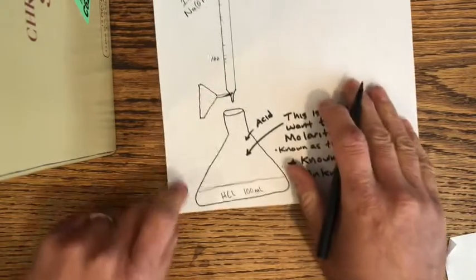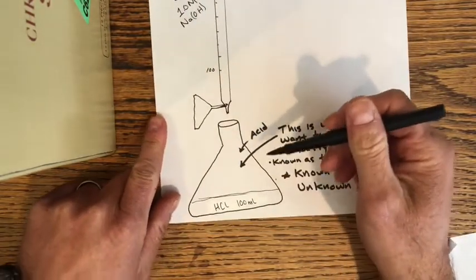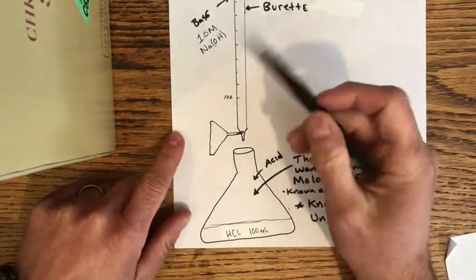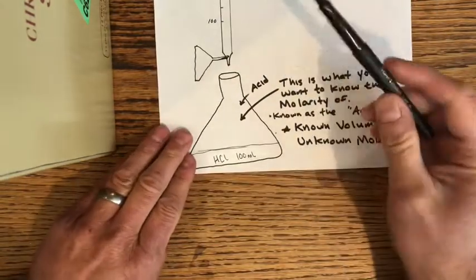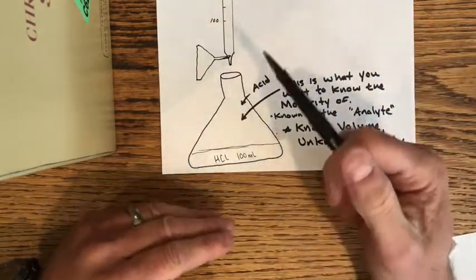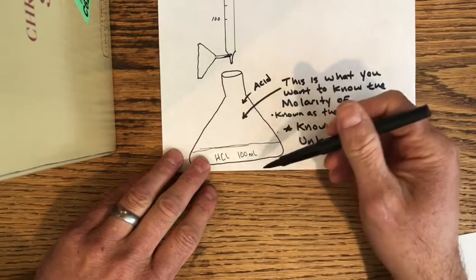Okay, so if you were to just add the base into the acid, you wouldn't really see anything happening, because if you think back to the reaction that's going to take place, all we're going to make is salty water, right? But what we want to remember is that the ions are recombining to make salt and water, and that's the neutralization part of this.